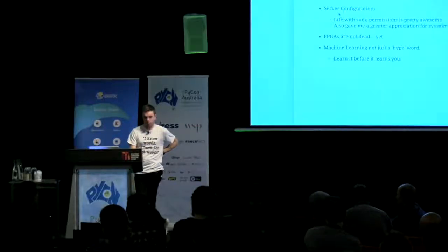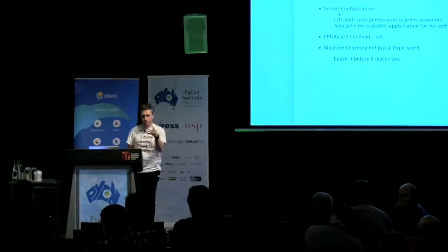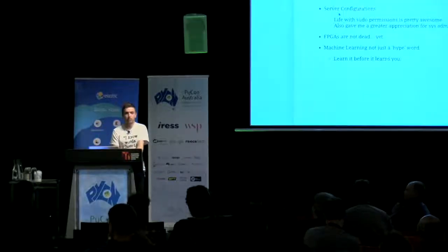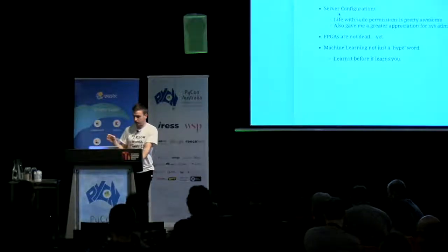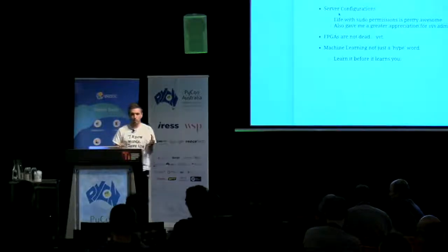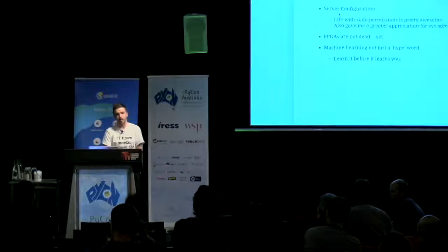So they're often CPU based as well. There's a lot of them that'll run things like hash tables against a genome, so it'll index the genome and run against those. They've managed to make them powerful enough so that they're sort of proportional to the log of the size of the genome itself, in a way. As far as this goes, when it comes to the bottlenecks, it seems to be base calling, converting that analog signal into nucleotides, rather than trying to find where those nucleotides map to a genome. Okay.